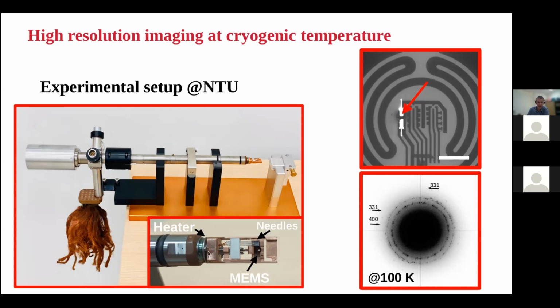And by having this active element, you don't have any heat transfer between the tip and the rod of the holder, which makes the holder much more stable than it would be if we didn't have this active element.